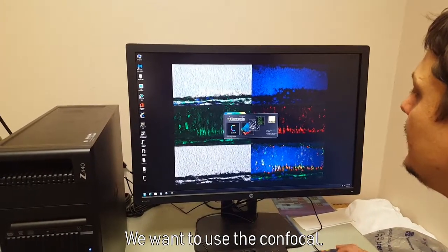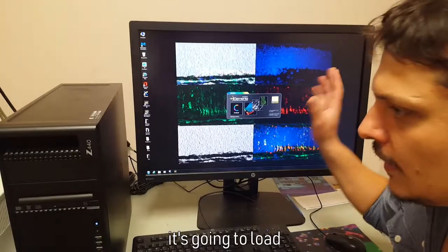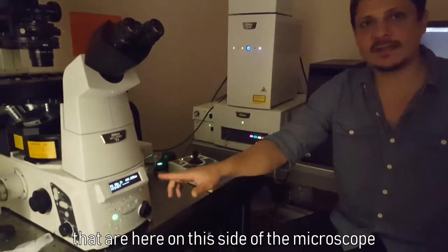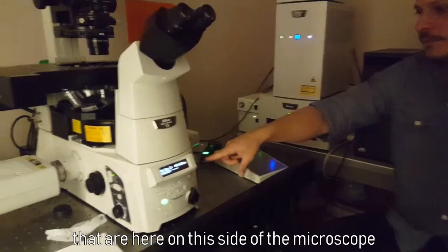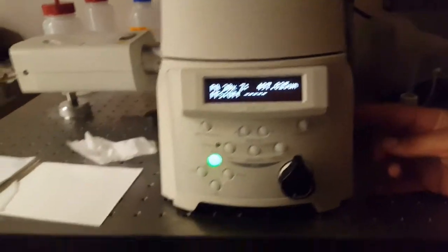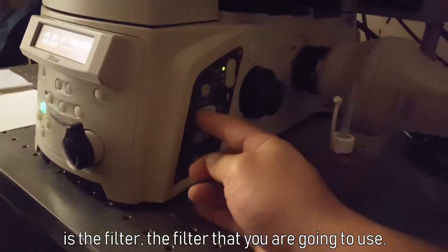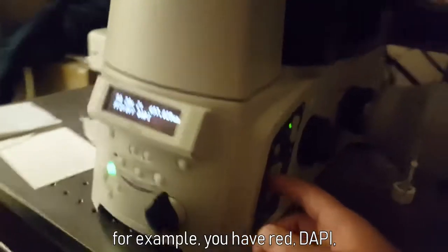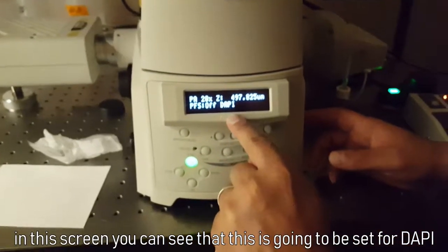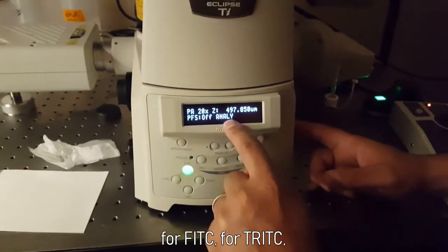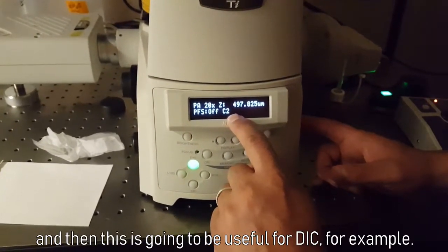I'm going to use the confocal. It's going to load the works that are here in this side of the microscope. What you can change with these two volumes is the filter that you are going to use. For example, you have red DAPI. In this sense, you can see in here it is going to be set for DAPI, for FITC, for TRITC, and then this is going to be used for DIC for example.